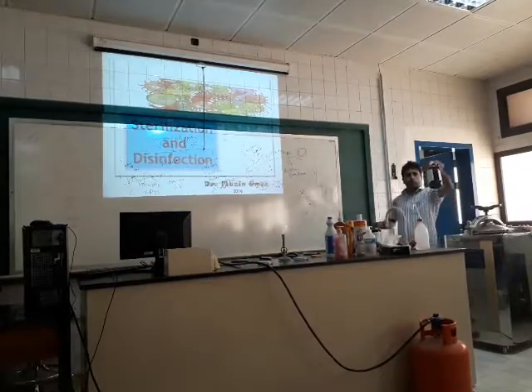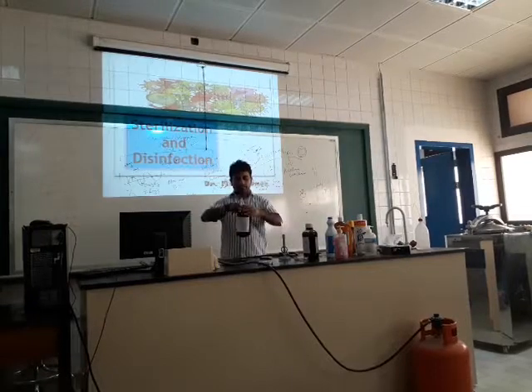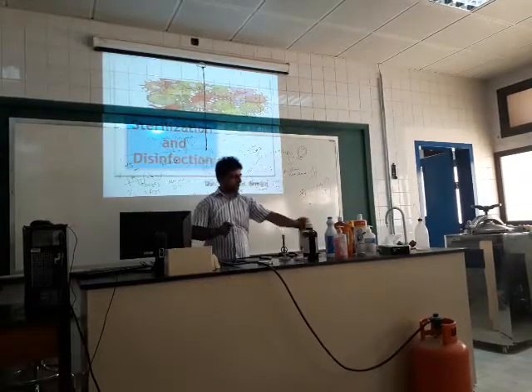This is the phenol, okay? If you put a few drops of phenol, it will work as a disinfectant, and this is the hydrogen peroxide.